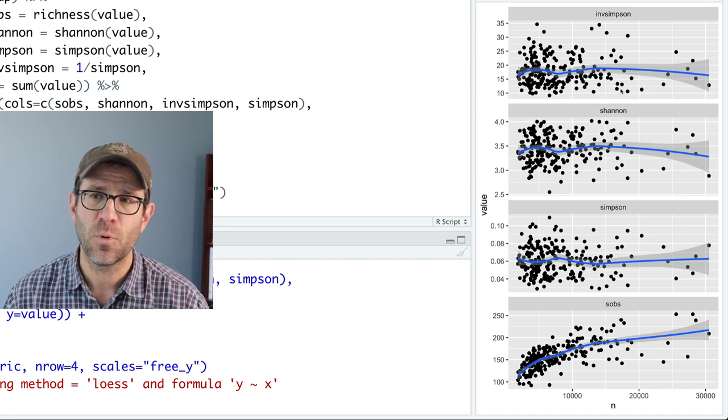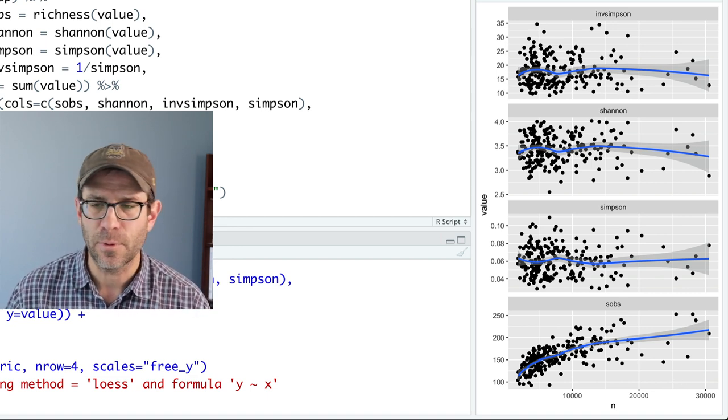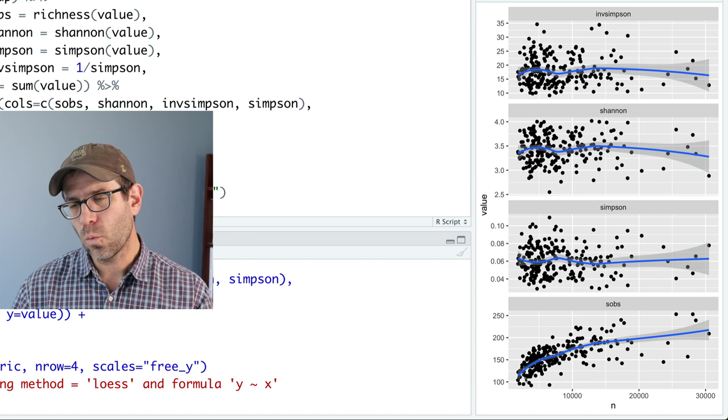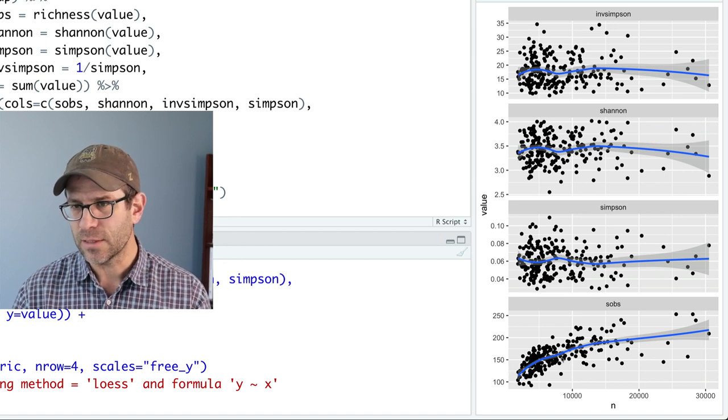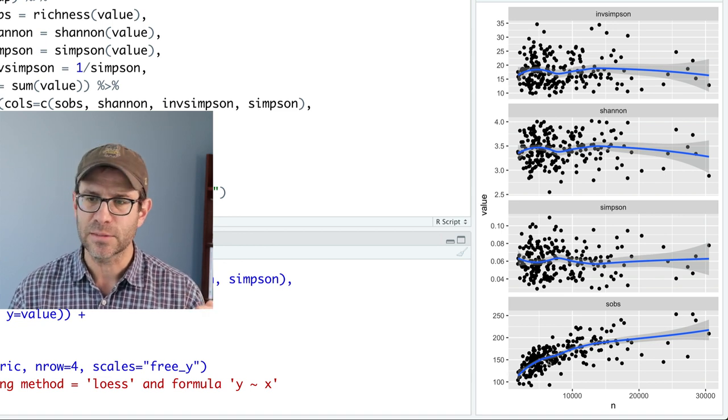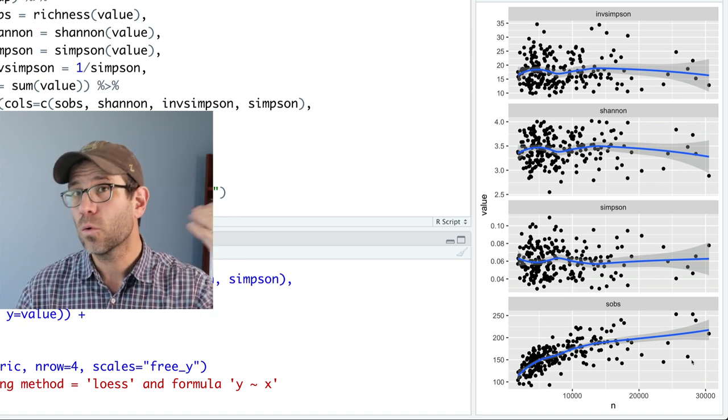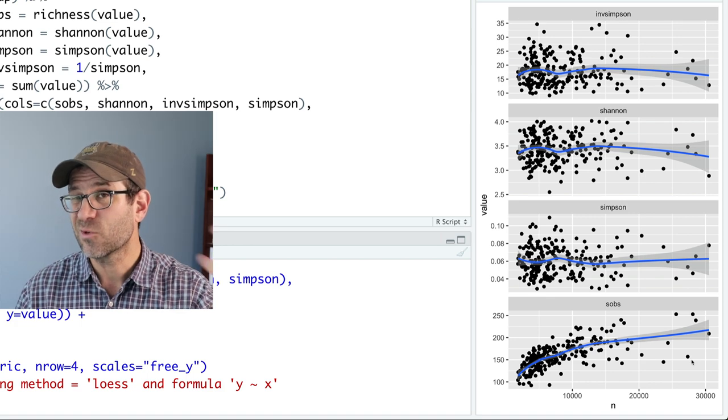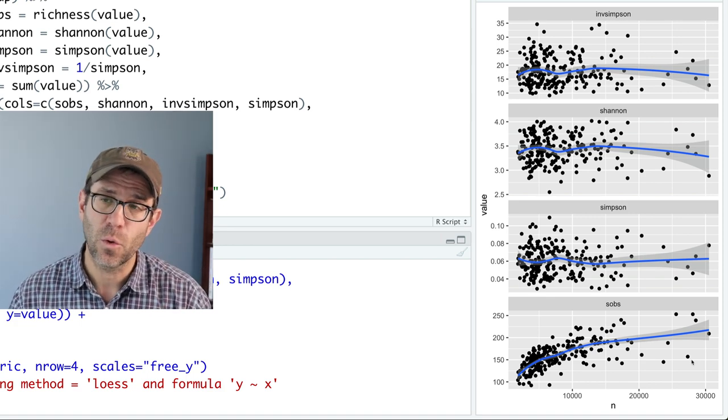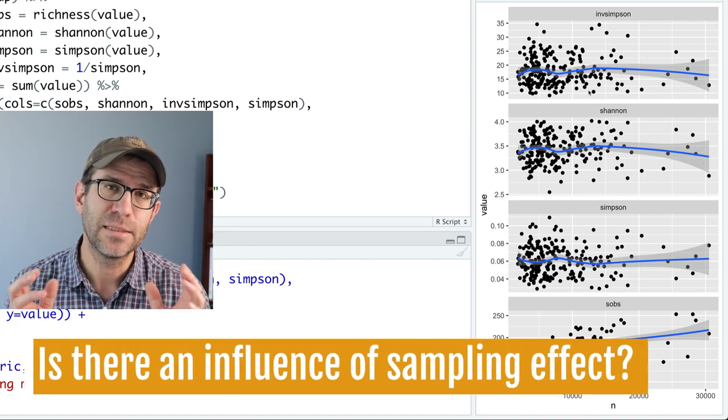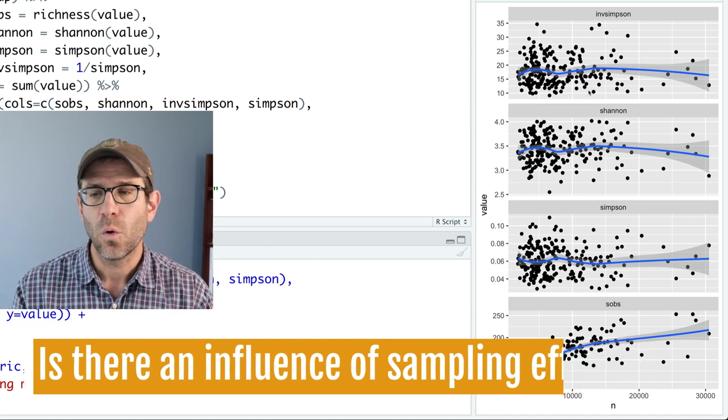And each of these points represents a different sample. And so what we see is that for Sobs, I think it's pretty obvious that as you sample more, the total number of things, the richness in that community is also going up. One thing to keep in mind is that this is the observed data, there might be some treatment effect in here, whether it's the sex of the mice, the age of the mice, anything that we did experimentally to the mice.